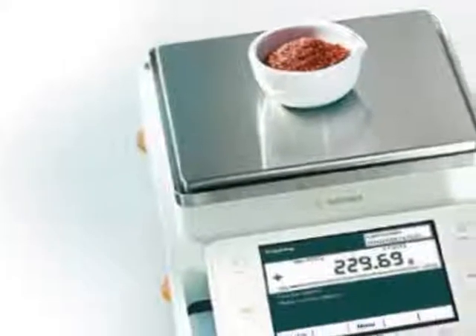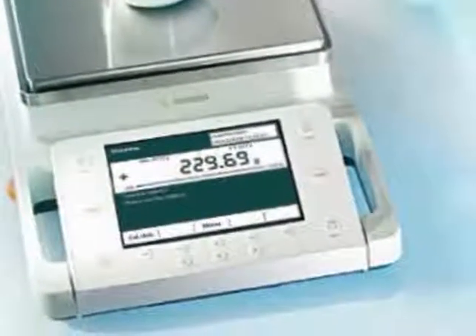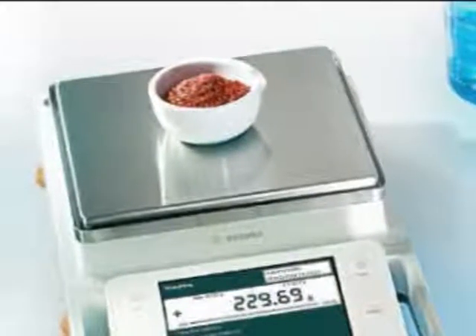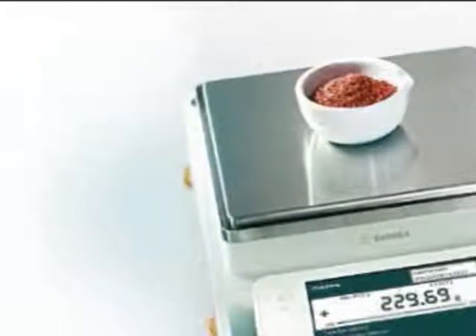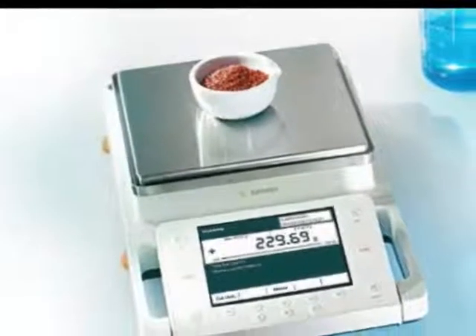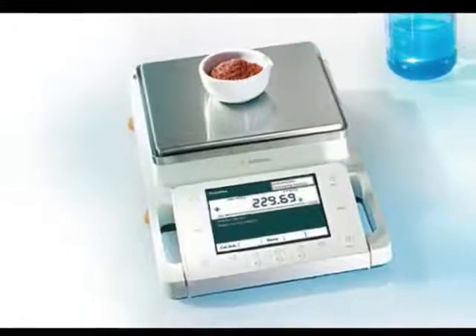The QBIS Modular Equipment Series enables you to customize your QBIS balance to meet your specific requirements for any weighing task. Offered in a choice of three display and control units, QBIS meets the requirements of different operating concepts and covers the entire range of laboratory applications.